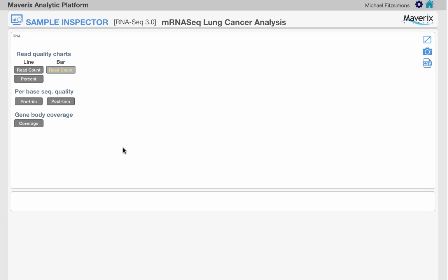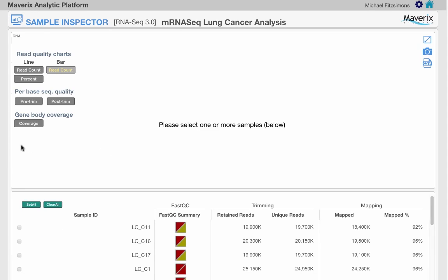The sample inspector may differ slightly within a variant analysis project compared to the RNA-seq results which I am showing you now.